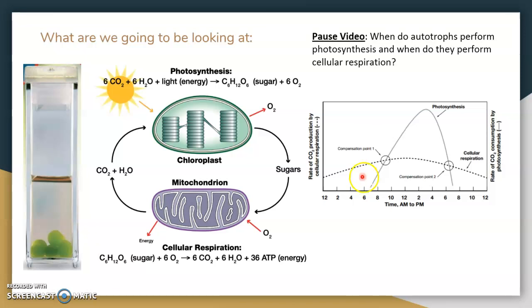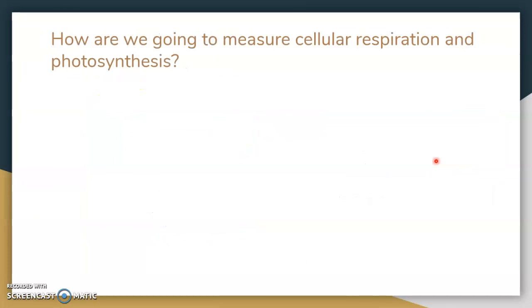What happens, however, is that when there's sunlight or photons, photosynthesis is just cranked up, so there's more oxygen being emitted out than CO2 in comparison when I'm looking at the ratio. So that's why it appears that only photosynthesis is on during the day, but the actuality is that that's not true, and cellular respiration is at its highest point during the day. So also take a second to think about, why would cellular respiration be slightly higher during the day? Think about how enzymes perform, like optimum temperature and things like that, and what is provided during the day that can maybe increase those enzymatic functions.